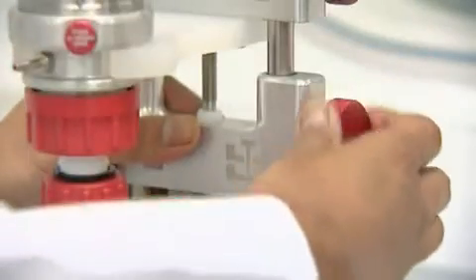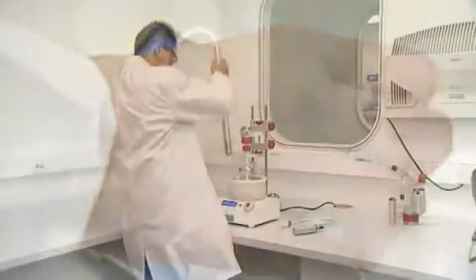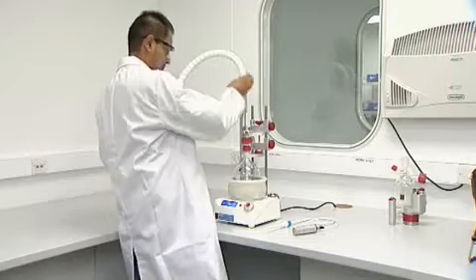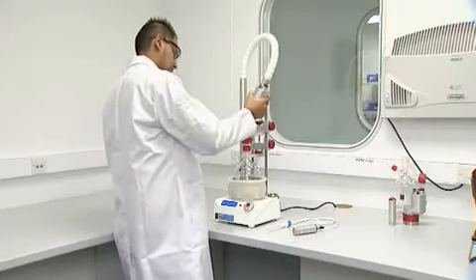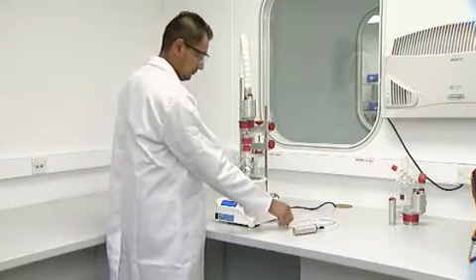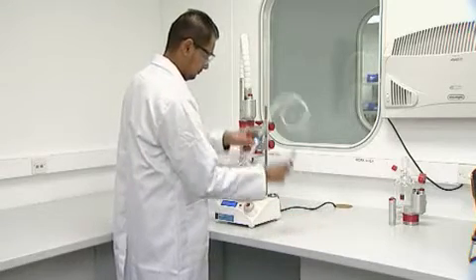The clamp automatically aligns a range of flasks to the dry bath. Turning the control knob changes the hotplate temperature and the magnetic stirrer speed. Easy plug-in upgrades include the Scorpion overhead stirrer for viscous solutions or large quantities of solids, and an in-reaction temperature probe.